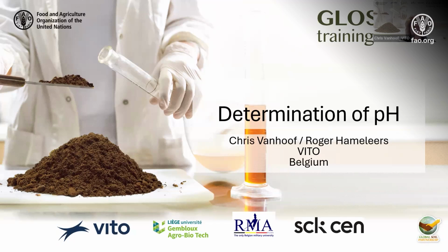Good morning, everyone. My name is Chris van Hoof. I'm working at Vito. It's the Flemish Laboratory for Environmental Monitoring in Belgium. I'm working in the analytical laboratory and I'm a senior researcher in the inorganic laboratory. Today we are going to discuss the determination of the pH.